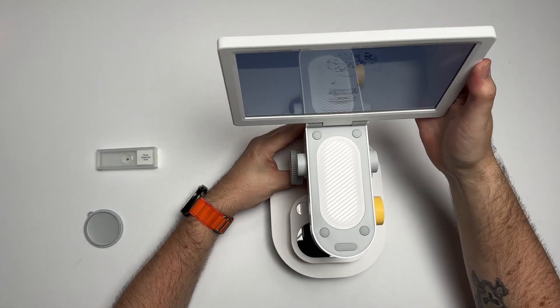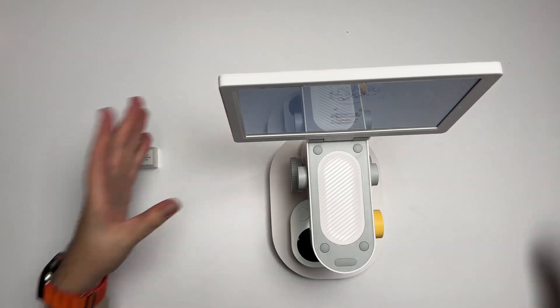So we'll go ahead and get this powered up. I'll try to angle this camera so we can show this a little bit better. What's also really cool is that this one's actually rechargeable — right now it's running off of the battery inside. You can take this outside and do stuff outside, so it's pretty cool.